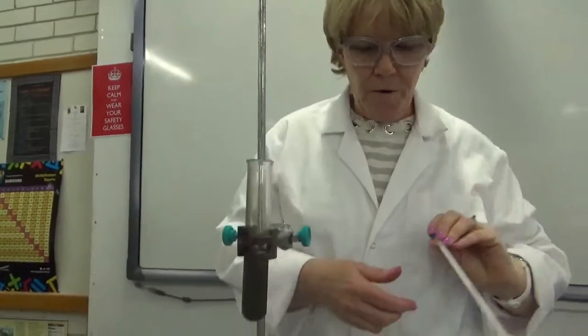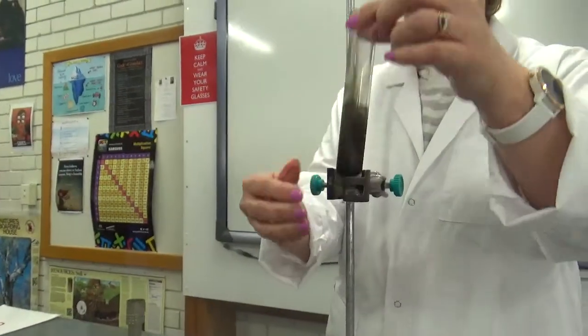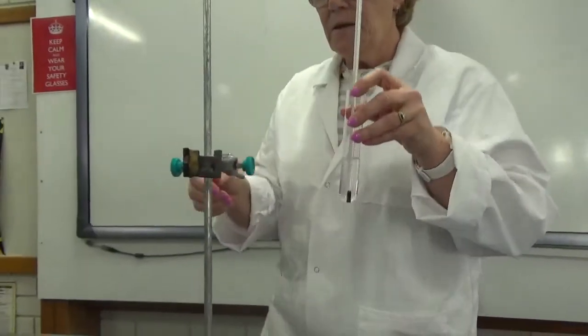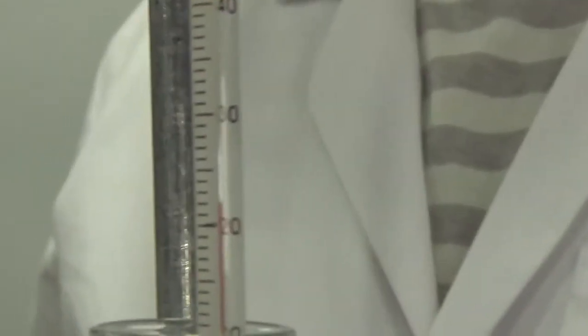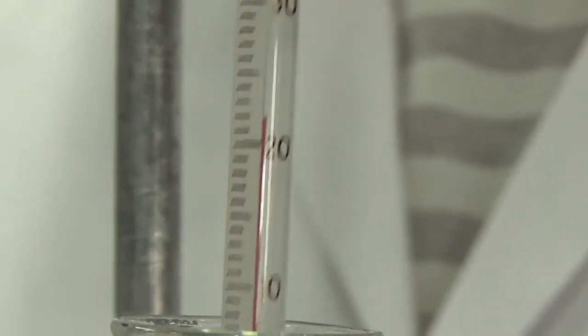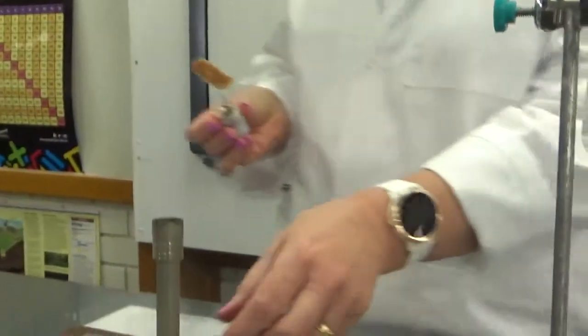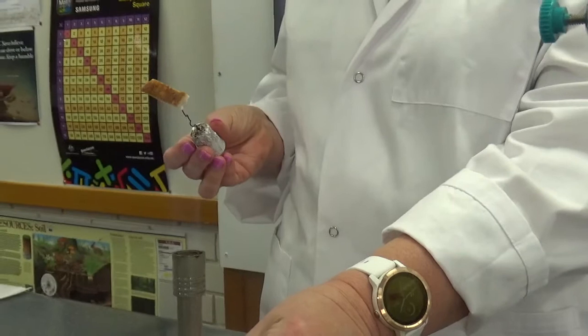One more to go. Now we've got to see how we go with this last one, because bread is really hard to ignite. So the bread can be a little bit dodgy sometimes. Let's see what our starting temperature is on that water — it's 22 degrees again. All right, bread. The question is, today, right here, right now — will we actually get the bread to ignite? This is very good if we do, because it doesn't happen all the time. Let's get a nice roaring flame and see if we can get this bread to light up.